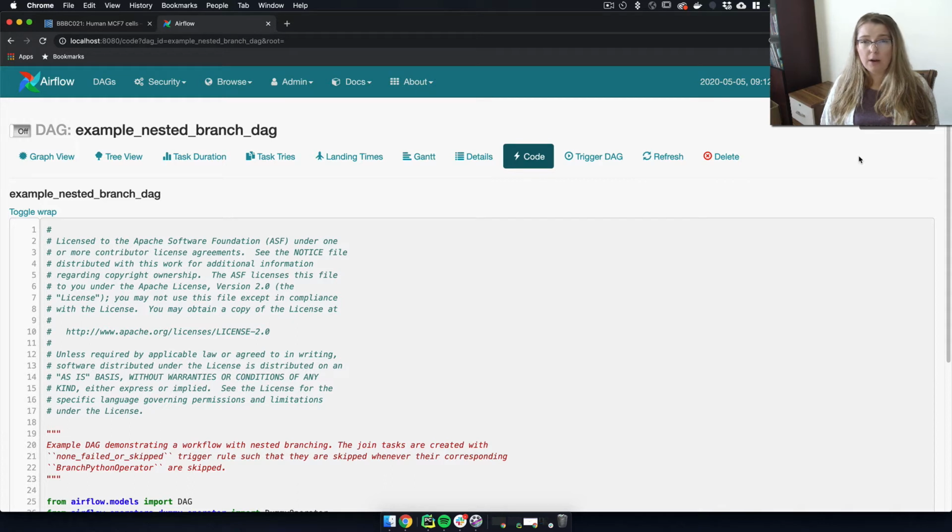And the other thing that I really like about Airflow, particularly for me, is that it's very agnostic to the compute backend that you're using. So if you have a laptop and you feel like, hey, I could get this done on my laptop, but I can still do some batching. I could still use the need for the job queuing system for all this kind of thing. You can use Airflow on your laptop.